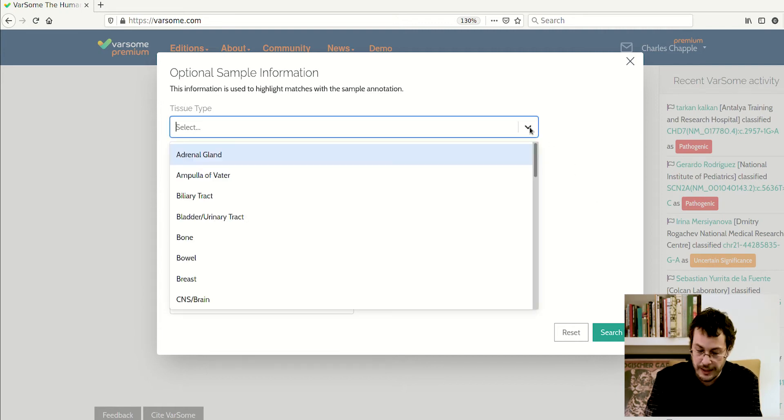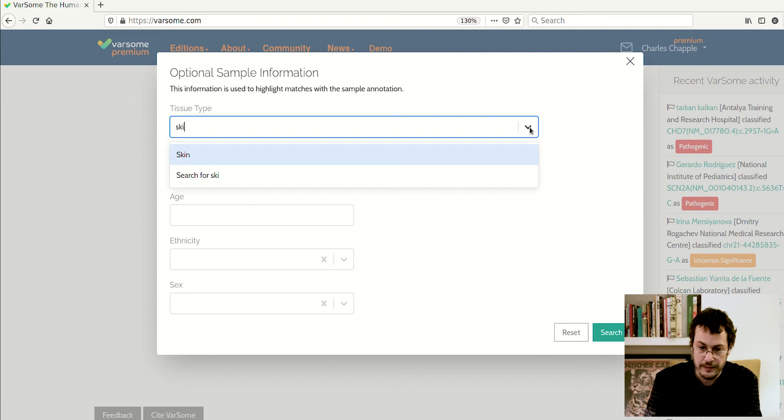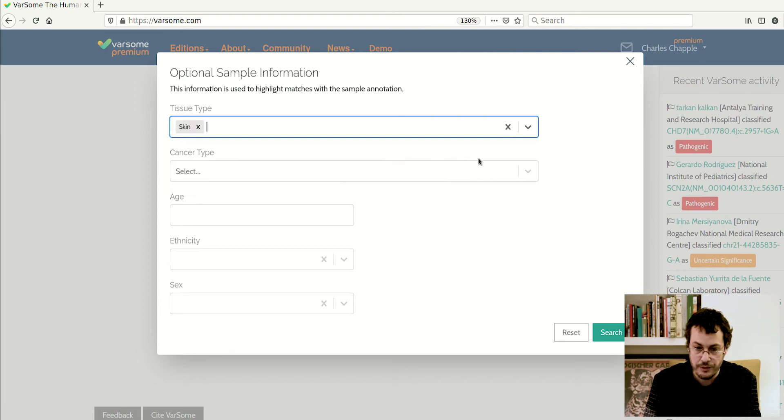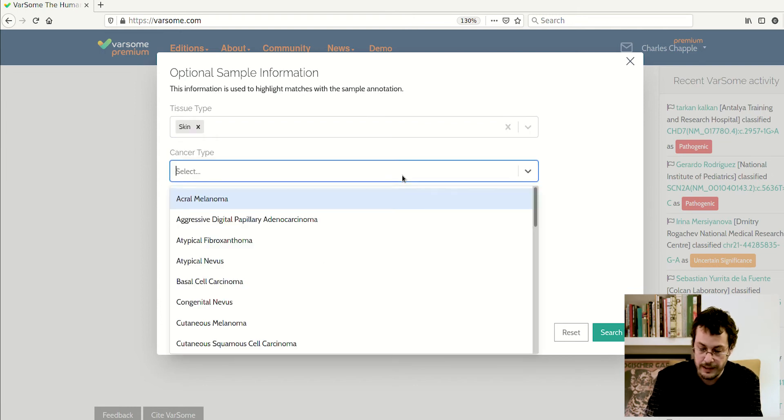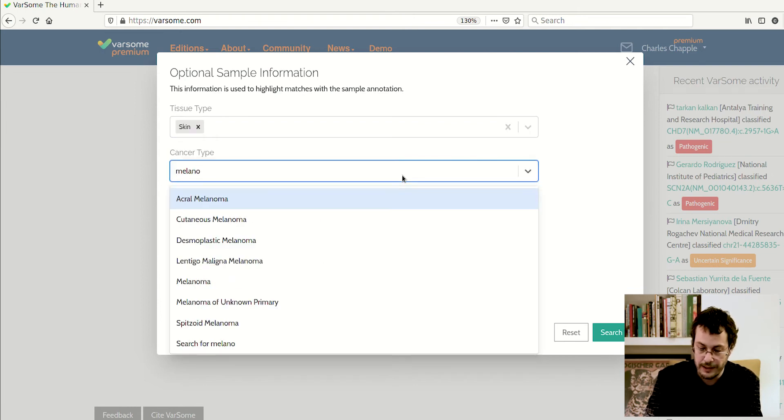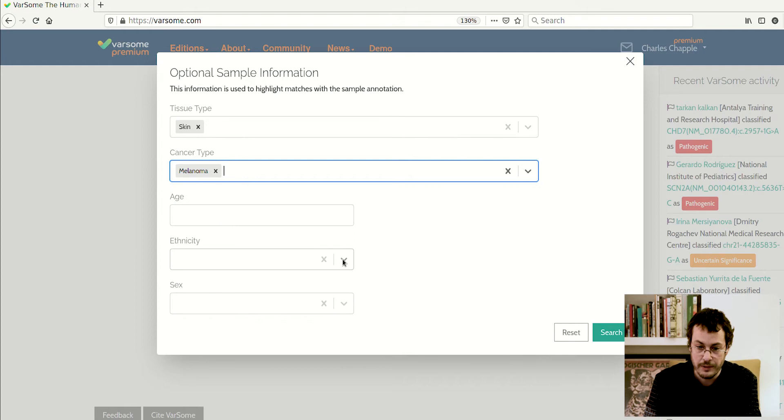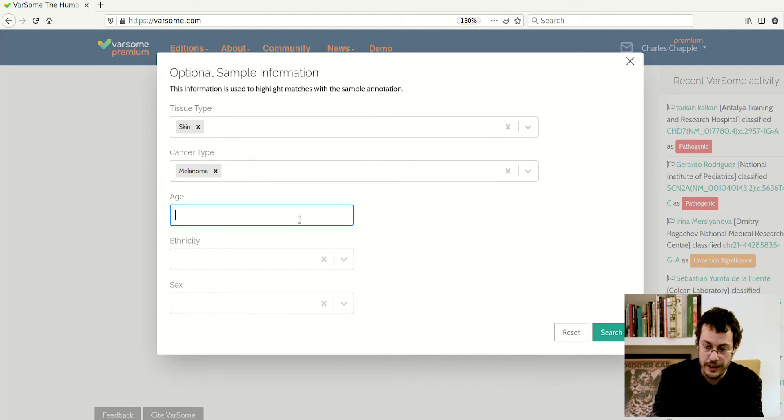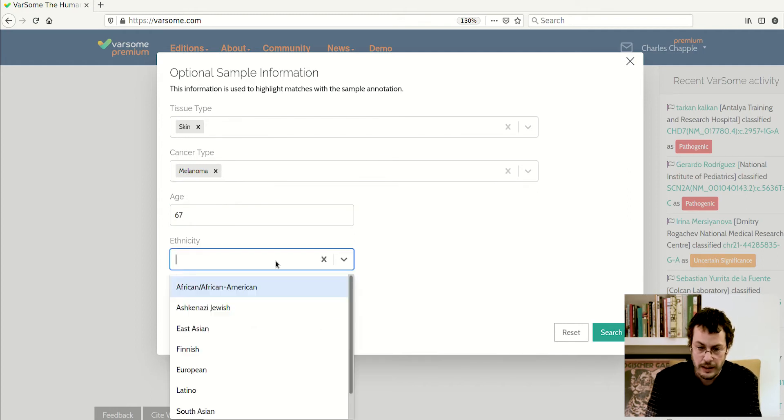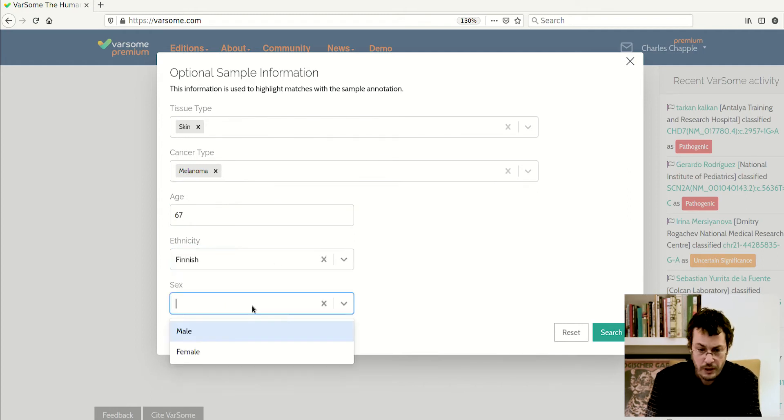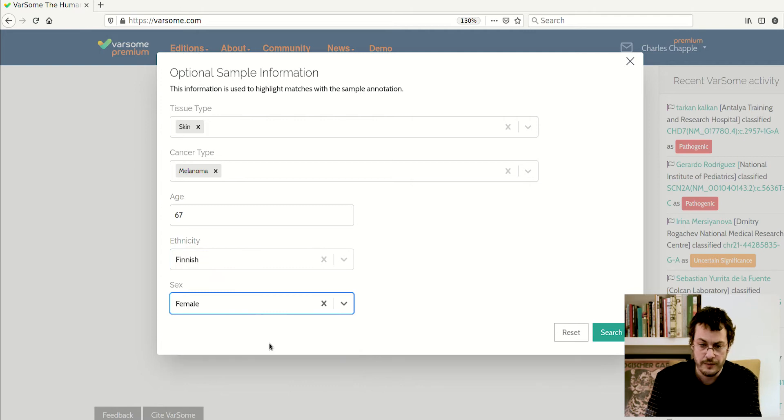So I will select skin as tissue type and I will select melanoma as the cancer type. We can give an age of, say, 67 years old, and ethnicity of Finnish and a sex of female.